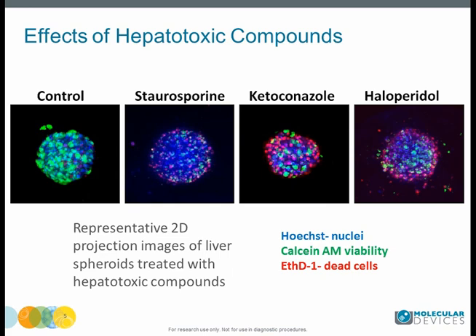Here are presented composite images of spheroids treated with compounds known to have liver toxicity. You can see phenotypic changes as a result of compound treatment.